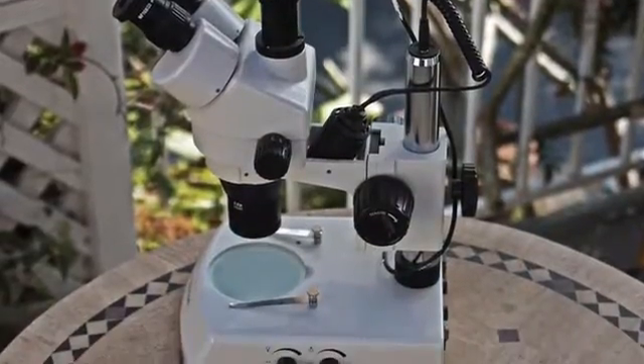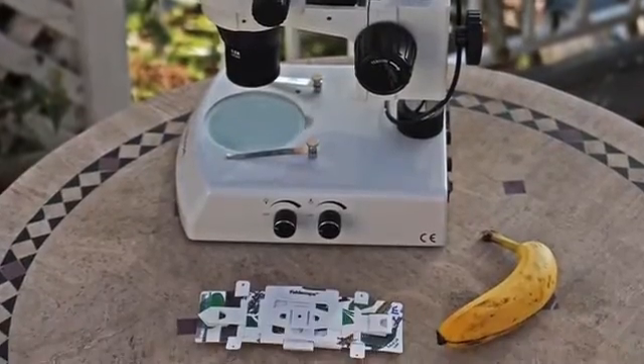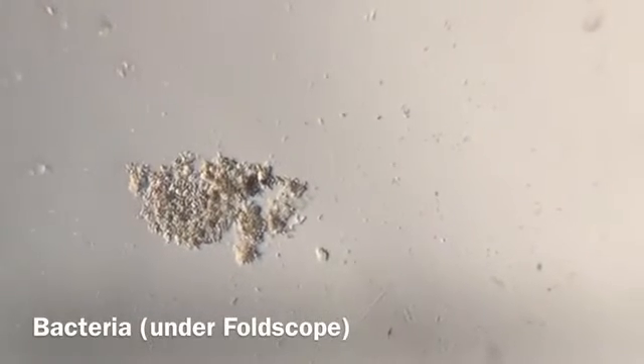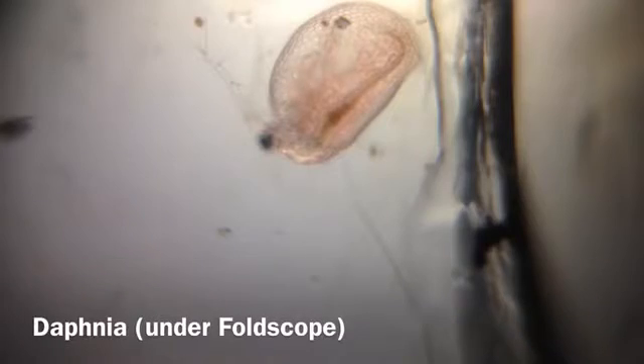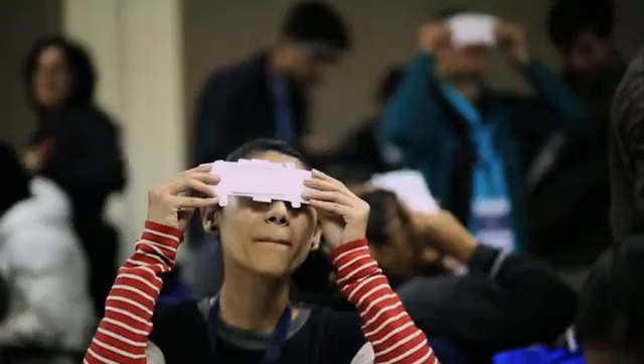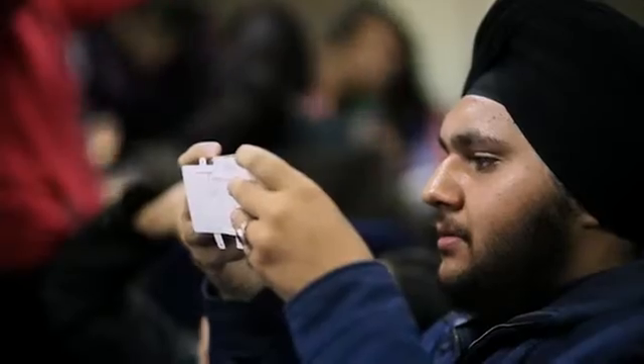The capabilities of the Foldscope are actually equivalent to conventional microscopes that cost thousands of dollars, but we build a Foldscope with $1 in bill of materials. We live in a world where a majority of life forms are actually invisible to our naked eye. There are scientific tools like a microscope that allow you to experience it and really change your perspective and turn you into a curious observer.